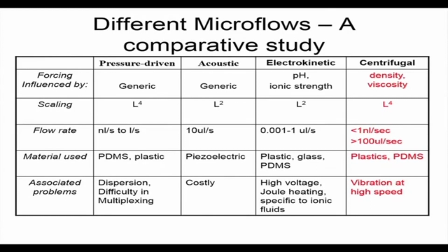Electrokinetic: plastic, glass, PDMS. Centrifugal also commonly plastics and PDMS. Associated problems: pressure driven flow, dispersion.